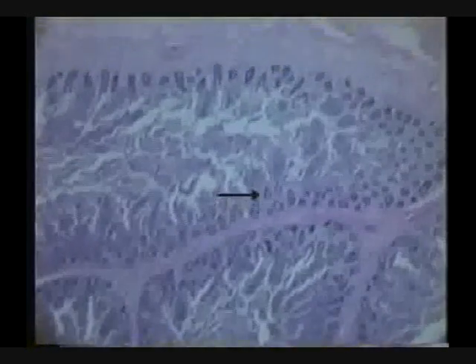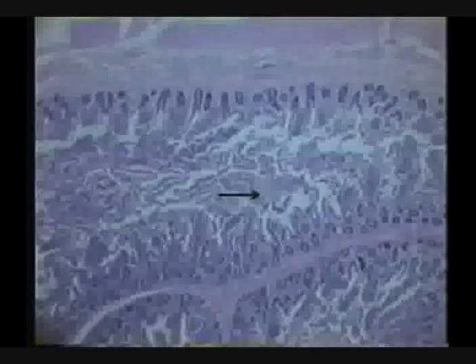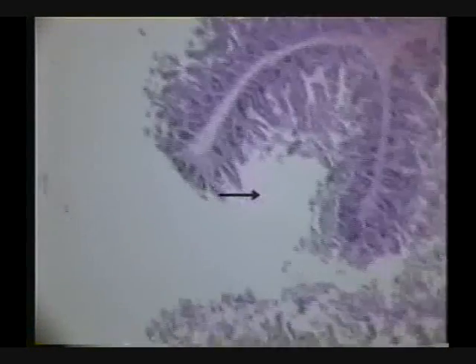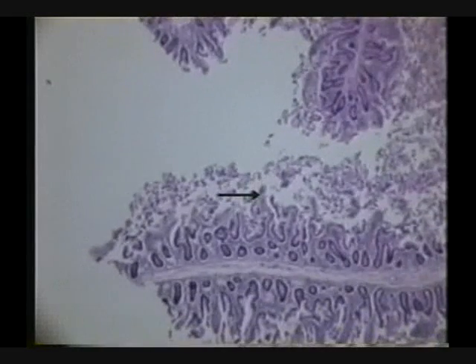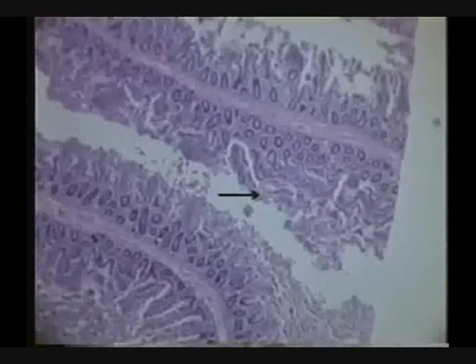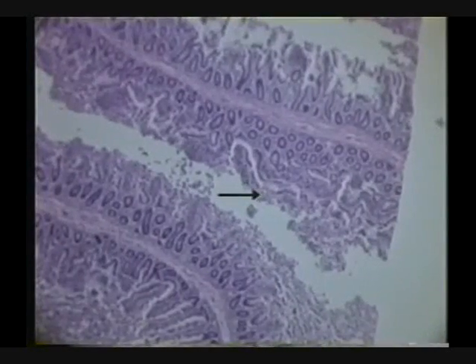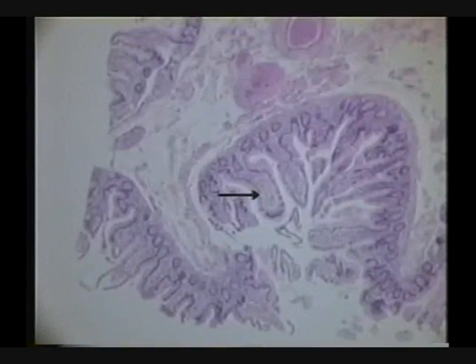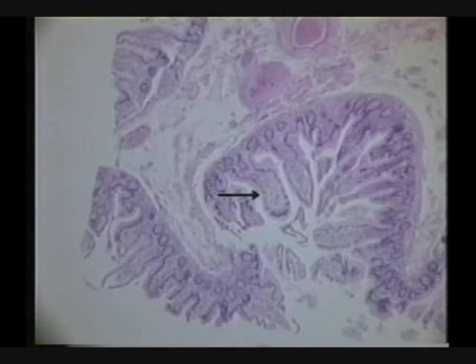Because then off of the plica, see, here are villi. And I go out here and look around. There's villi out here. But again, what's happened? They're all falling apart, aren't they? The villi are not in good shape, even on this jejunum. So I will move on to the ileum. And now we find some fairly decent villi.